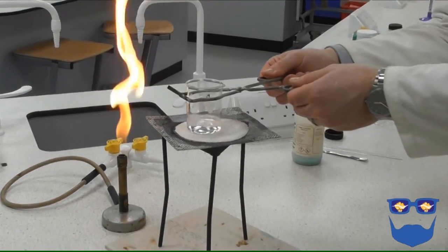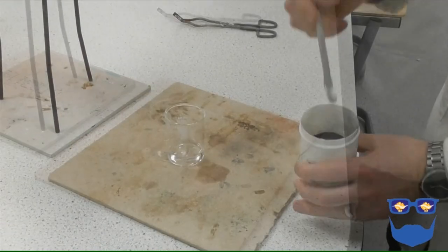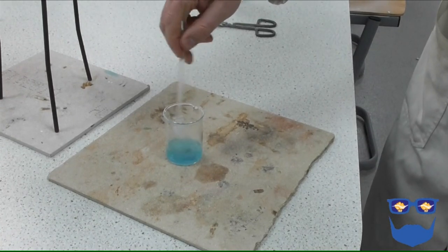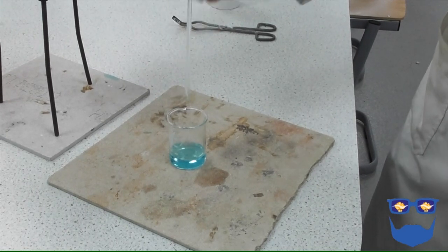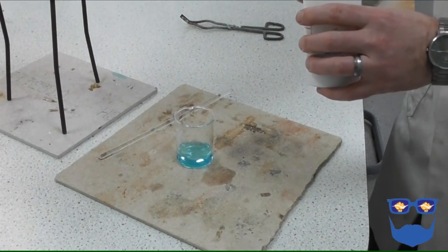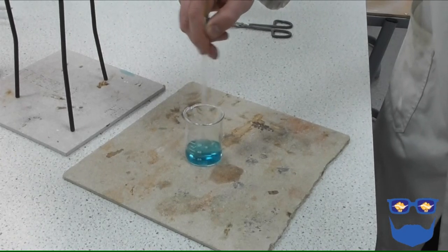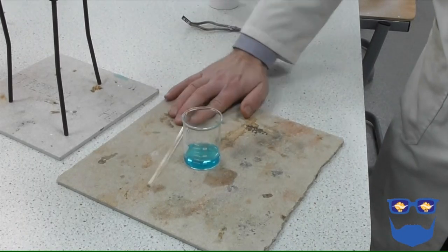Lift the beaker off the tripod using the tongs and stand it on the heatproof mat. Add a small sample of copper oxide to the acid — I suggest a rice grain size — and stir it with the glass rod. You will observe that the copper oxide reacts completely with the acid, and we should be left with a clear, pale blue solution of our soluble salt. We might still have unreacted acid, so repeat until no more copper oxide can react as all the sulphuric acid has been neutralised. The copper oxide will now be in excess.